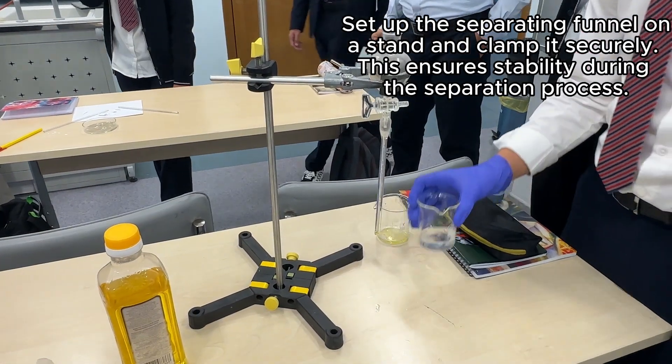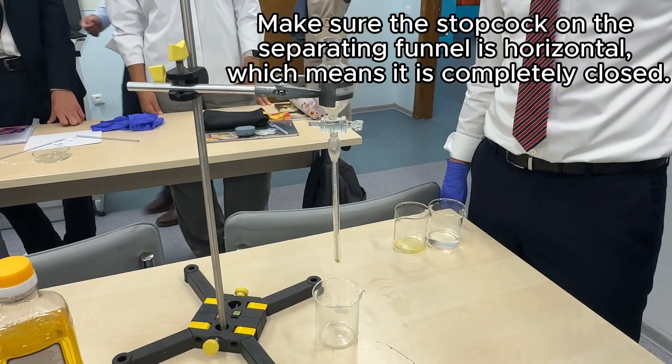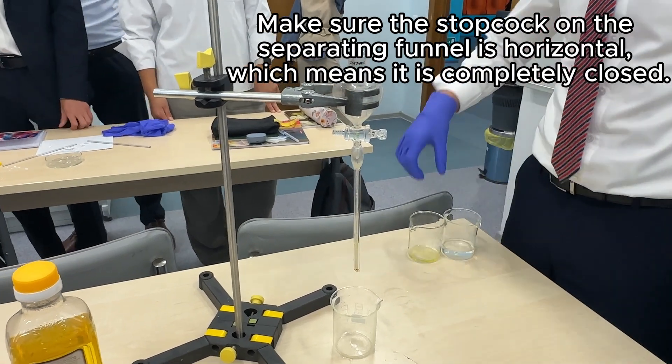Set up the separating funnel on a stand and clamp it securely. Place a beaker under the separating funnel and make sure the stopcock on the separating funnel is horizontal, which means it is completely closed.